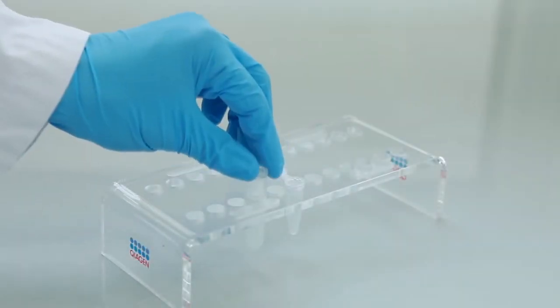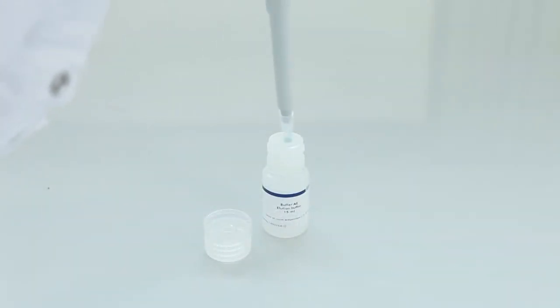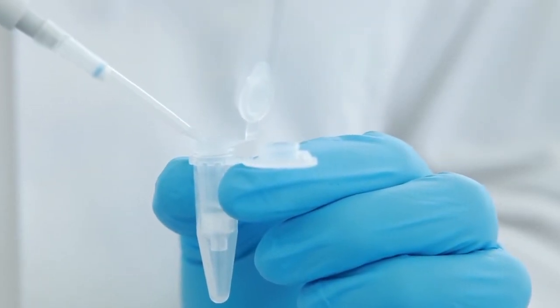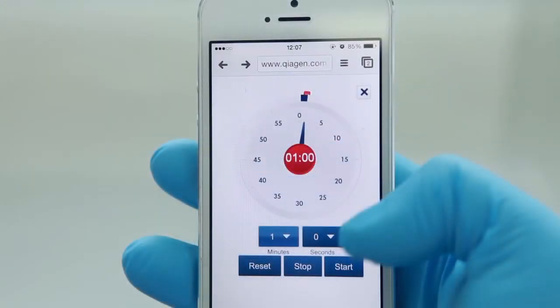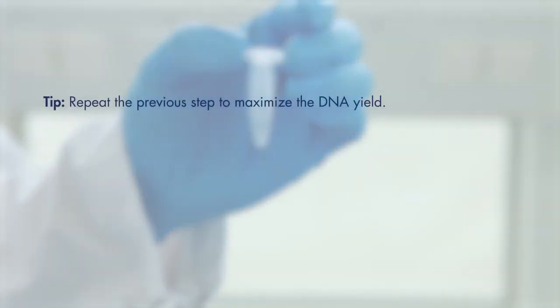Place the spin column into a new microcentrifuge tube. Add 200 microliters of buffer AE. Incubate for 1 minute at room temperature. Centrifuge for 1 minute to elute the DNA. For a higher DNA yield, repeating the last step increases the elution efficiency for small volumes.